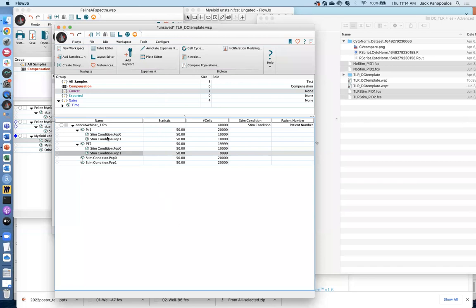There's a question about plugins. My plugins don't work. I receive an error each time I use them. Flow AI has failed to produce the expected derived parameter. Okay, so for the problems with the plugins, what I would highly recommend is to simply send an email to FlowJo@bd.com. Just copy and paste what you've written me here. And what will happen is they will set up a screen share session with you and figure out what's going on with your computer, and they'll get it to work.